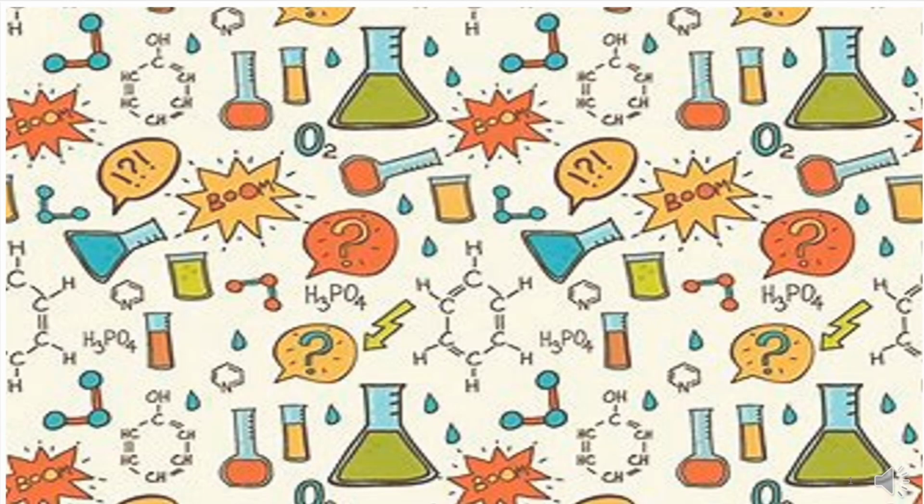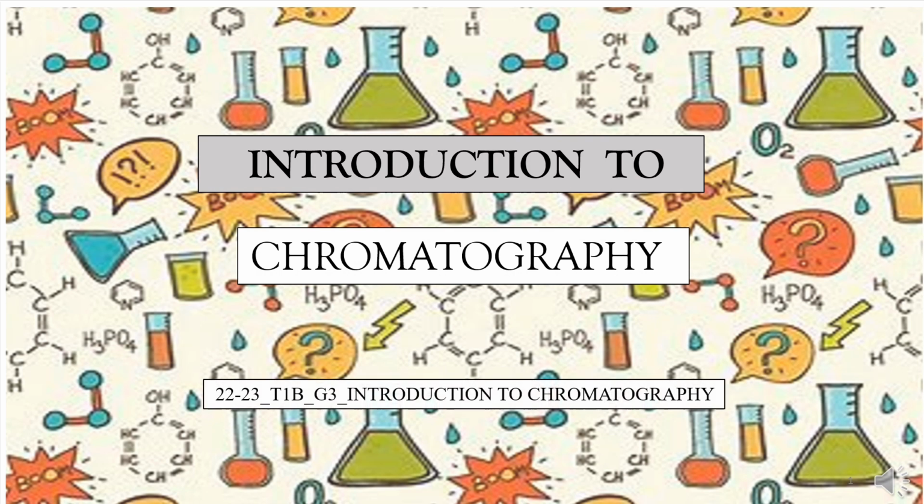Hi everyone, welcome to this short presentation on Introduction to Chromatography. Chromatography is a powerful analytical technique used in many fields including chemistry, biology and environmental science. In this presentation, we'll take a look at what chromatography is, its history and different types of chromatography.